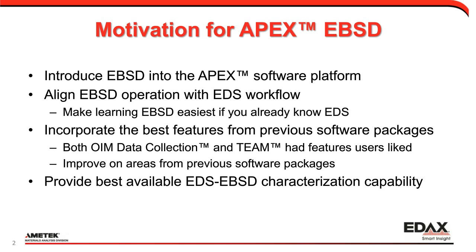And then one of the key goals is to incorporate the best features from previous software packages. We've had two legacy data collection programs, one which is OIM data collection, the other which is Team. Both of these have had a number of features which users have liked, and we've tried to make sure we've ported those over into the APEX platform. But of course, at the same time, we've evaluated both and tried to improve on areas from both software packages to provide the best of all worlds and provide the best available EDS and EBSD characterization package for our users.